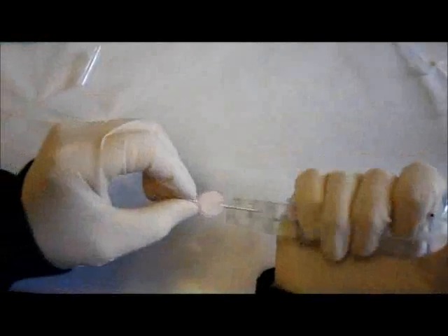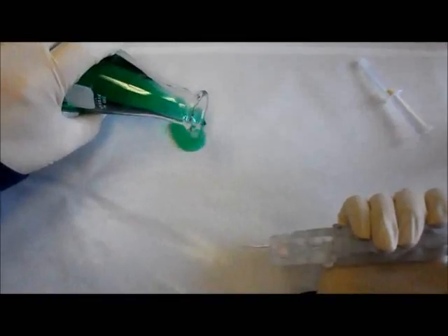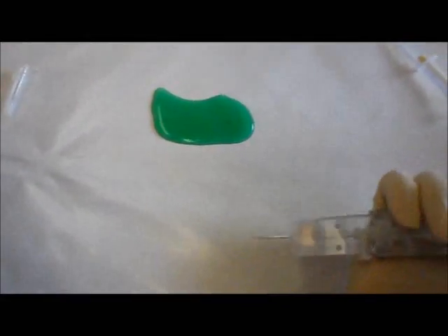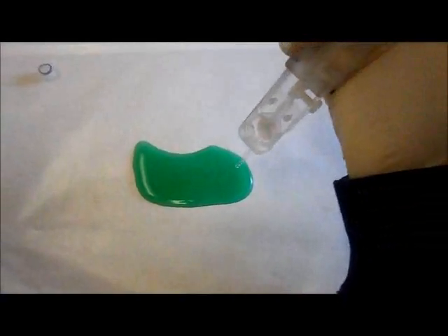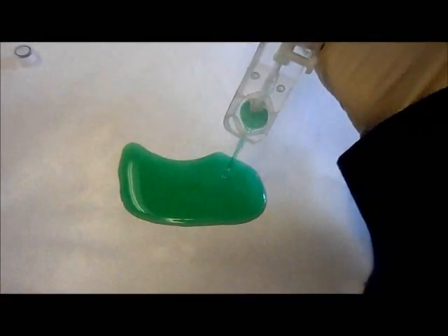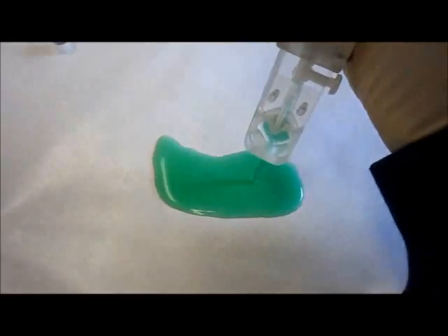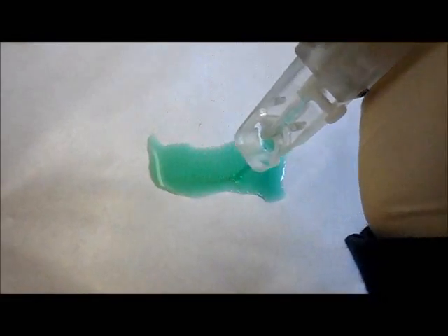I next want to demonstrate, and I'll use a little filter here, how you could use this device to recover cells and do an analysis on the cells that you express back out of the cartridge. So I'm going to pour some fluid right on the countertop here. Let's say you were doing a HACCP analysis for microbial contaminants on a surface that you were using a solution to serve as a rinse and get them off the surface. You can harvest directly into your filter. As you can see right now, I'm filtering fluid out of there, there's air being sucked up and back to the fluid, and I can go through here and pick up my whole sample and any of the bacteria that are in it. That's a pretty interesting application that you can't do with any other kind of tool that we're aware of.